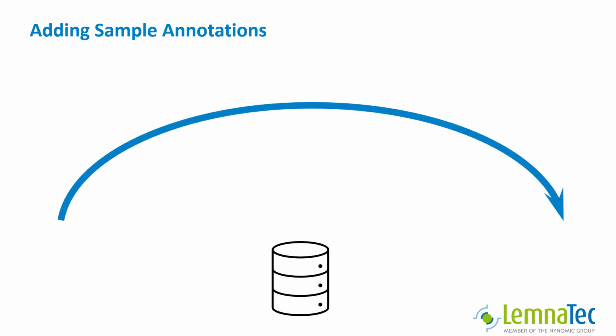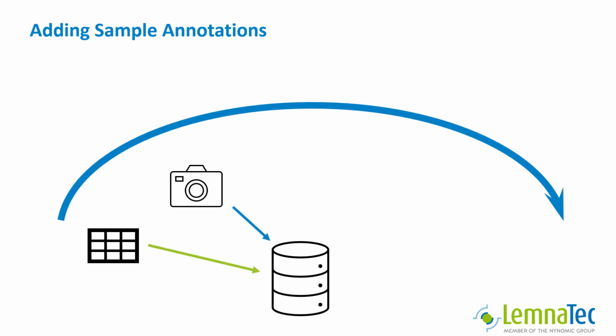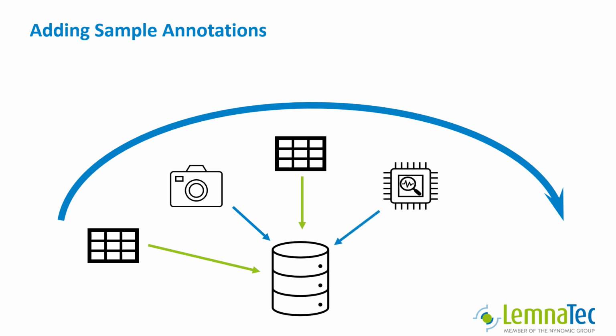You may add them before recording your data. In this case, you must use the Excel file import. Or after recording, but before you start your analysis, or after your analysis.